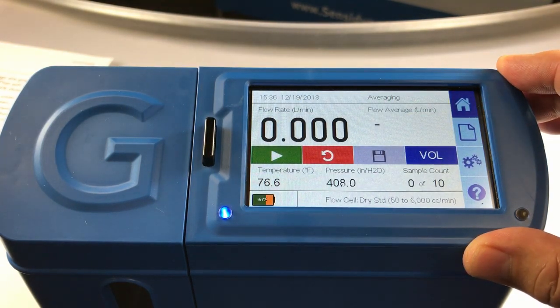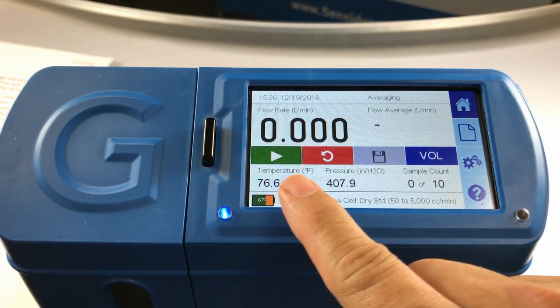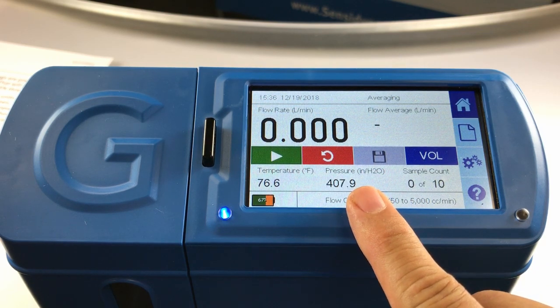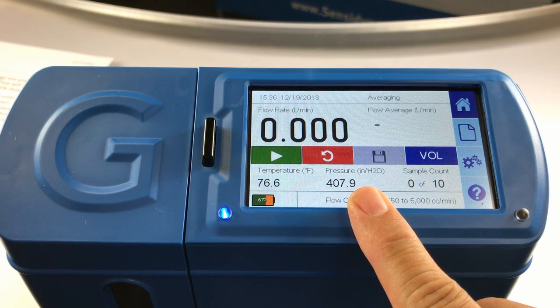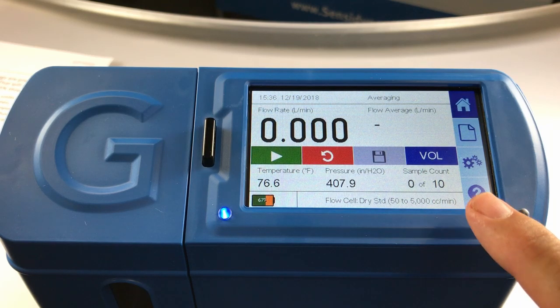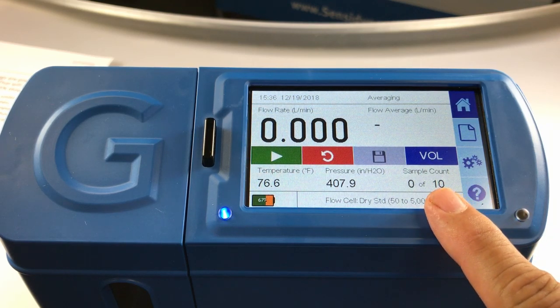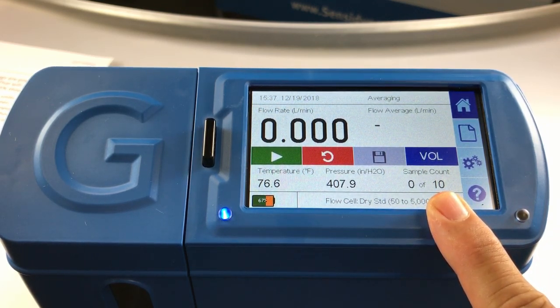I want to check that my temperature units and measurement units of pressure have changed to my preferences. I also want to check in the lower right corner to see that my sample count has been set to 10.